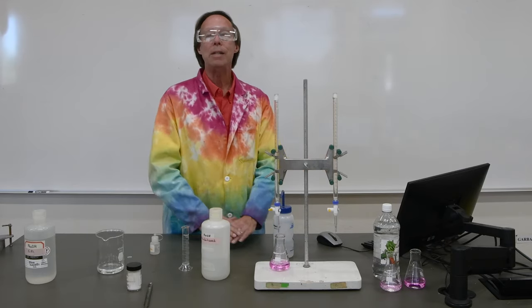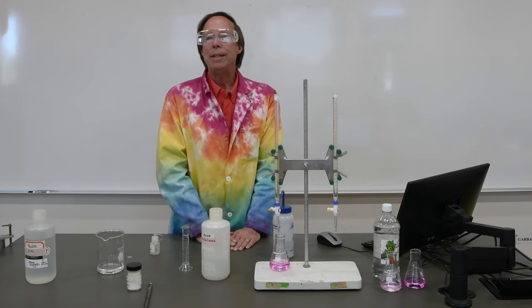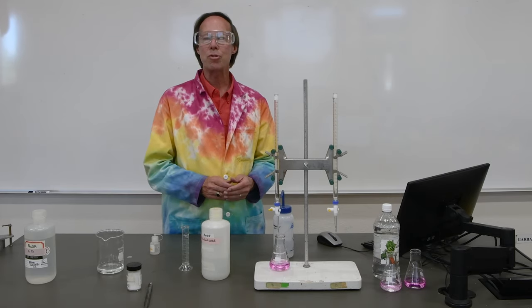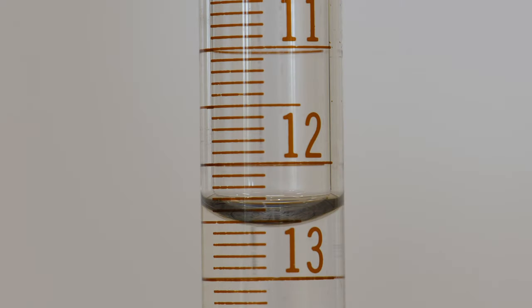You have all the data you need now, and you have instructions in the lab manual and in the pre-lab video, so you should be able to do all of your calculations and then turn in your lab report. Go ahead and get the final burette reading for our second trial with the vinegar, and then you can take your data and go ahead and do the calculations and answer the questions at the end of the lab.